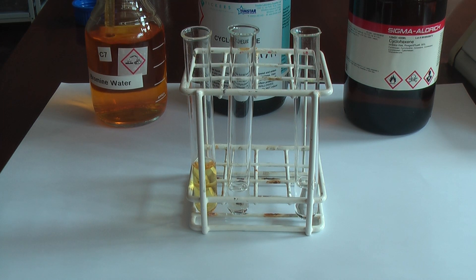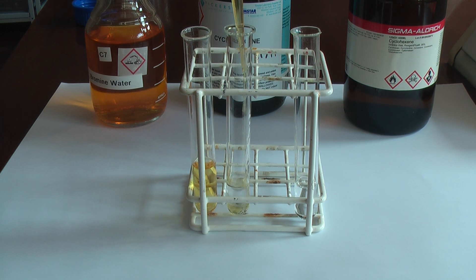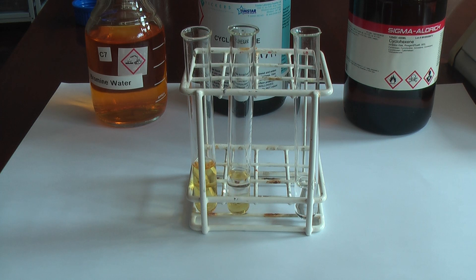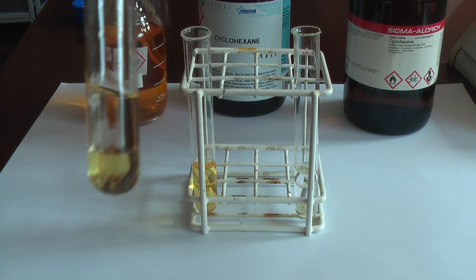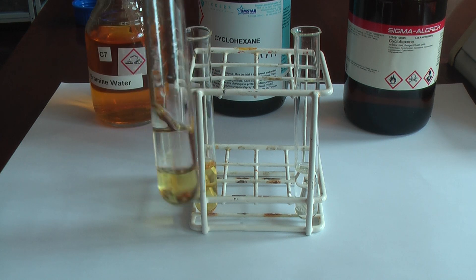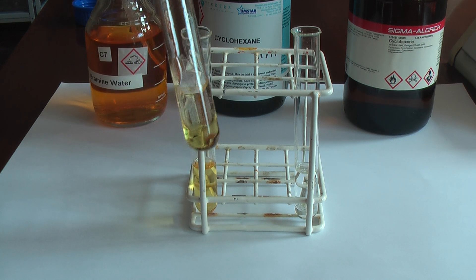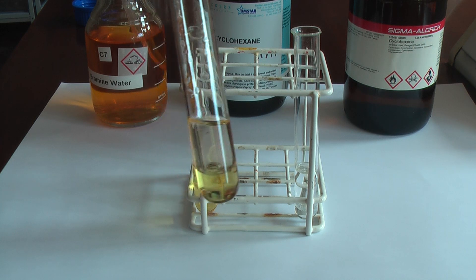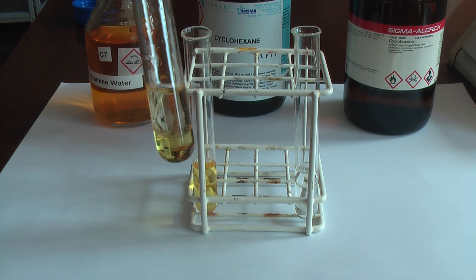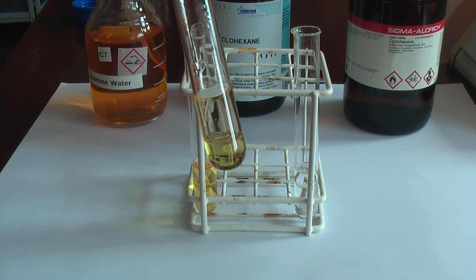Now when we place a little bit of bromine water in the cyclohexane and in the cyclohexene, what I want you to see is that it's formed two layers. The top layer is the cyclohexane because it's less dense, and the bottom layer is the bromine water, and it hasn't really changed color at all.